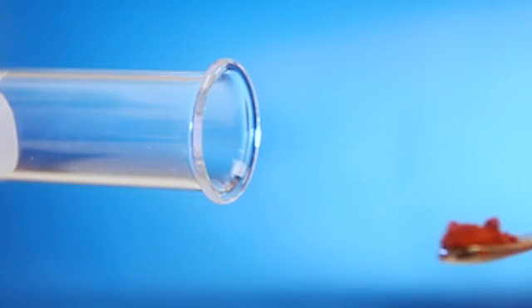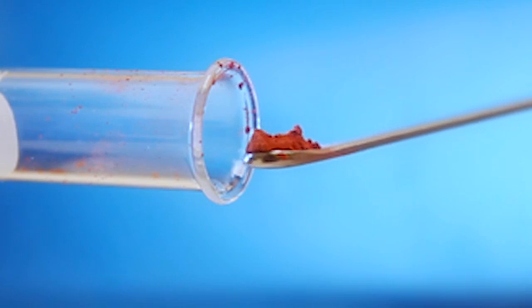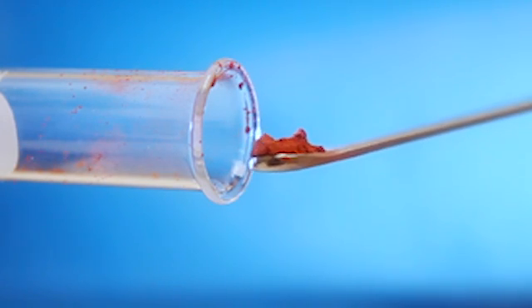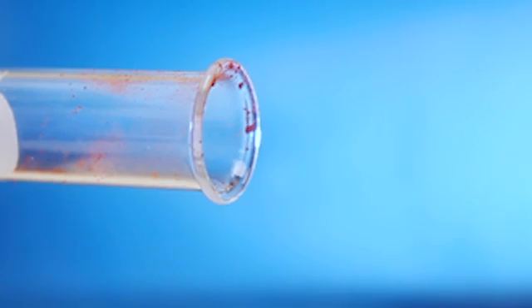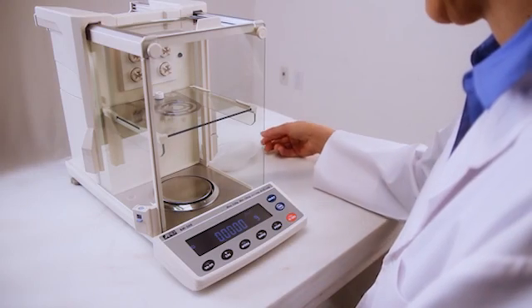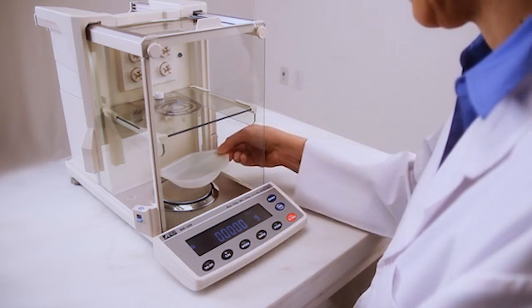Even laboratory glassware, not only plastic containers, can become charged just from normal handling, raising the risk of cross-contamination. The resulting static also makes weighing more difficult.